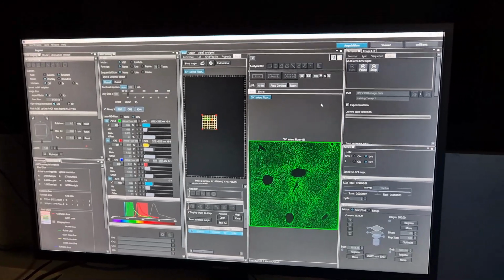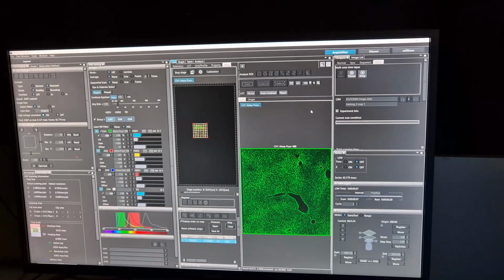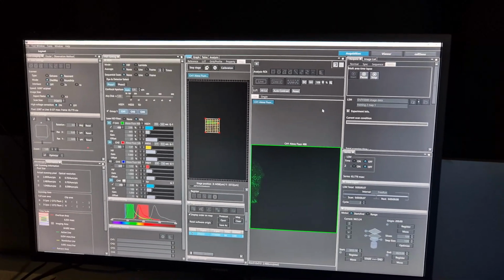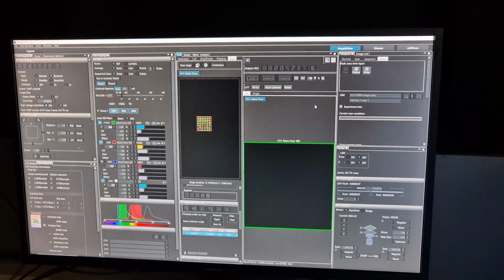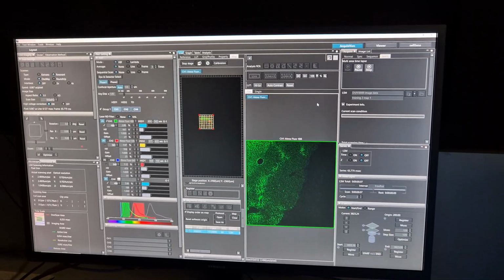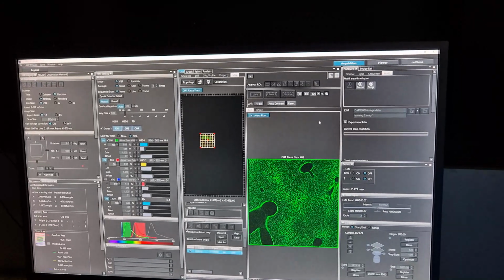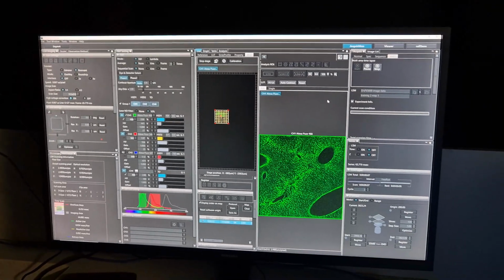So what is this staining for this sample? I assume it's GFP. GFP. So to start with, if you have a tissue, you would probably want to have a stain that stains the outline of the cell, and one that has a nucleus, and then whatever you're interested in. Again, it depends on the question you're asking, but as a starting point, yeah, I think it would be useful.